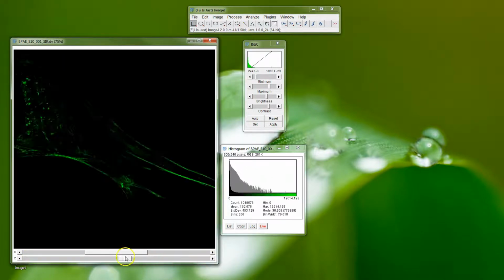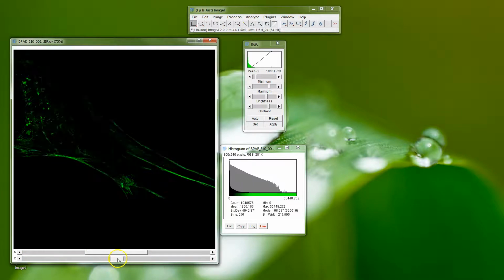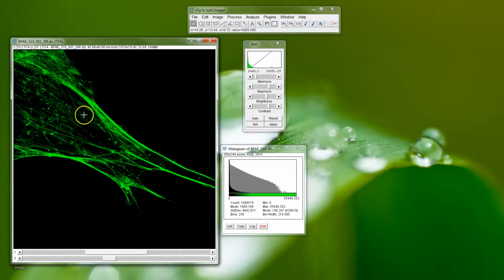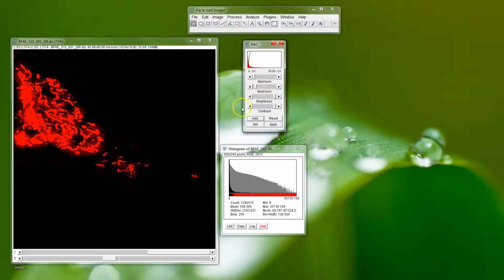So you can kind of just crop off the far ends, and it's kind of symmetric, and that's what we would expect to see. The more symmetry we see in these artifacts, the more we know we're closer to the right oil. And so that's for the green. We kind of backed off the contrast there. Let's go to our red. I always, with super res, make it look terrible and then back off and have a look.